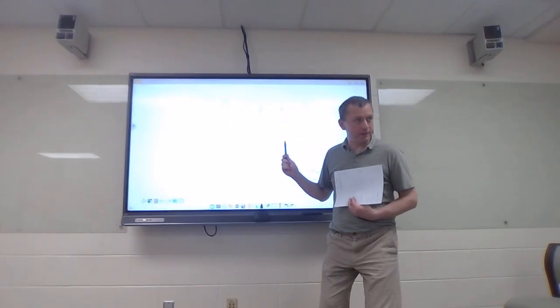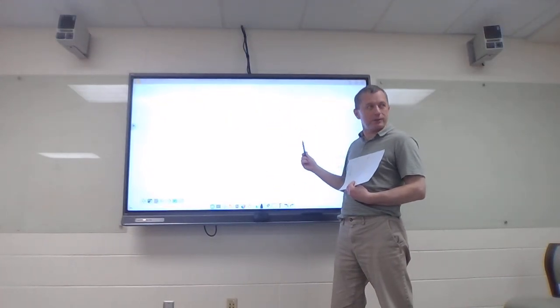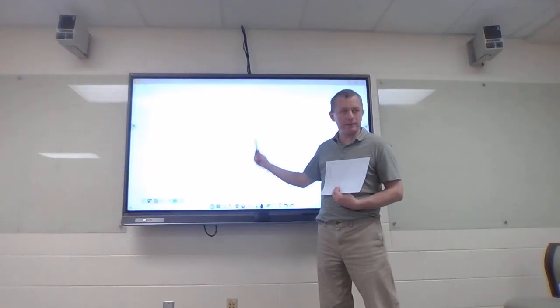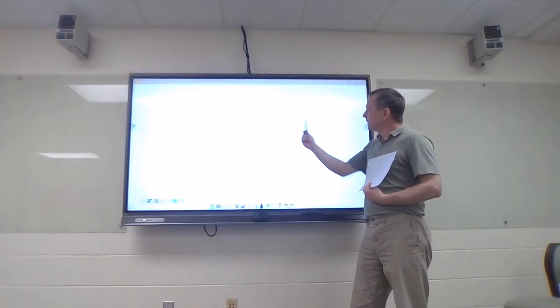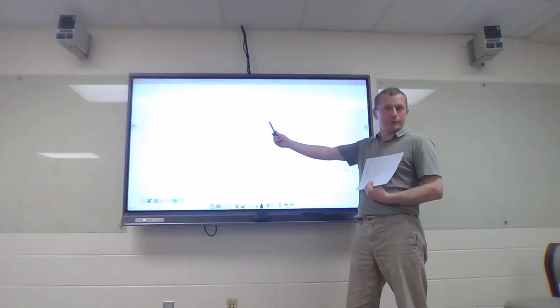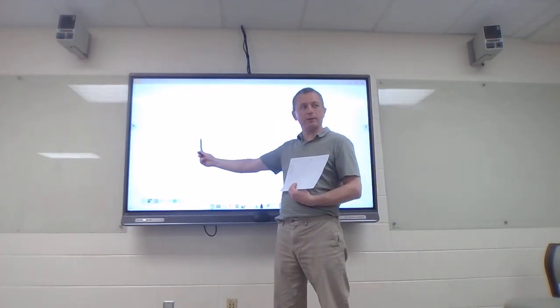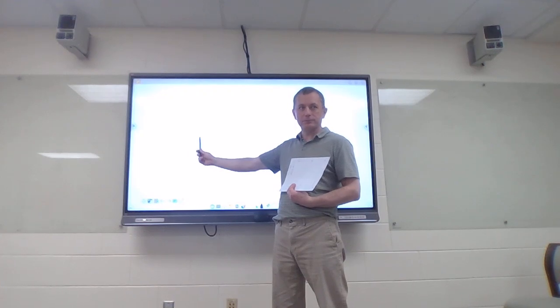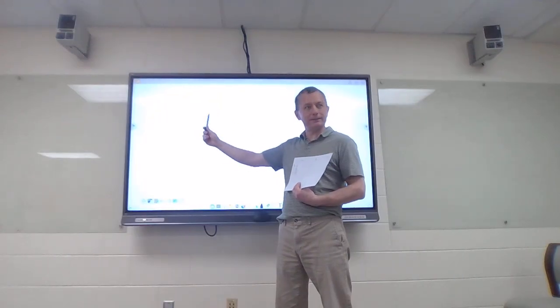If you want to look at splitting, this one, again, quartet, has 3 hydrogens on the next carbon over. Nothing to this side this time, so that's not messing it up anymore. This one's 3, because there are 2 on the one next to it. How many hydrogens are on the carbon next to this one? 0. So what happens when my N is 0? I get 1 peak, a singlet.